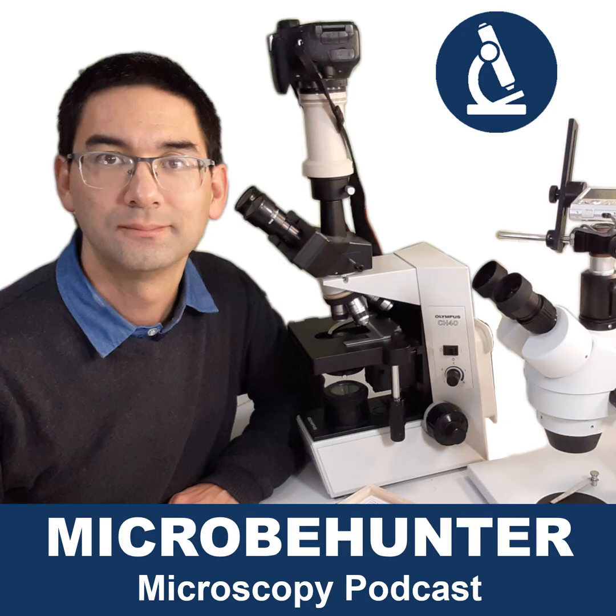So hello and welcome again, Microbehunter here, and Oliver that is, and I'm going to talk about why it's not possible to see some of the features of a specimen using a light microscope, and there are actually three reasons that I would like to talk about.